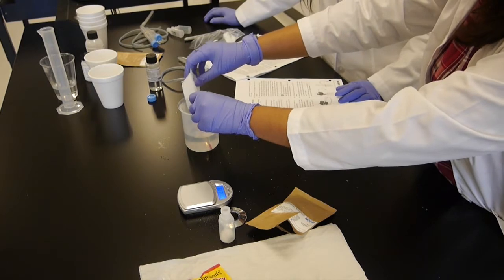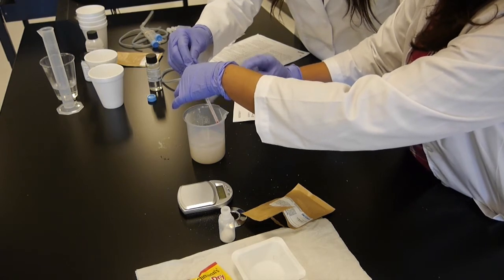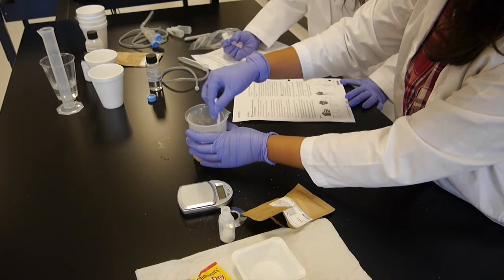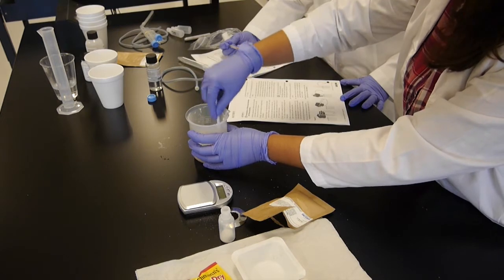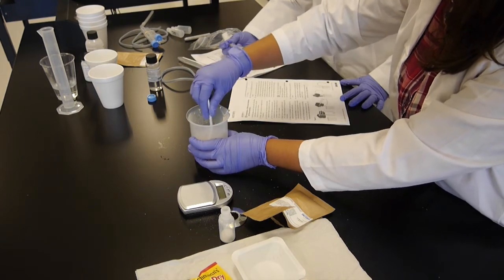And we need to stir this water. We need to stir this well, and also make sure that sometimes you take the temperature because the temperature needs to be around 35 degrees Celsius. Make sure to mix it well.